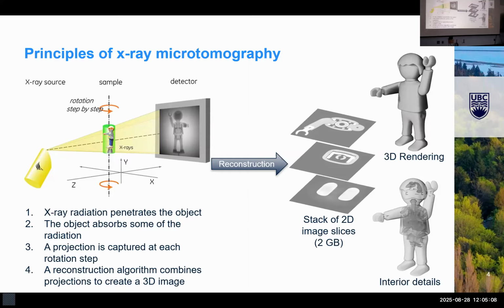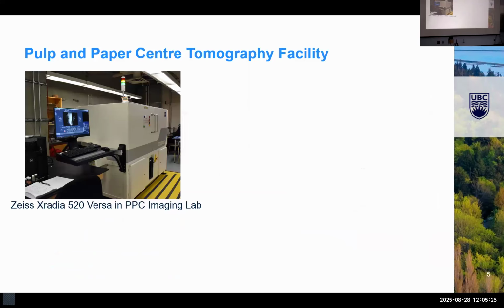You should become familiar with this Playmobil figure. He's our lab mascot, and we find it as a useful demonstration tool to explain these types of things. Also, whenever maintenance is done on our machine, a bit of a reality check that things didn't get messed up and all of a sudden his feet are in his head or something like that.